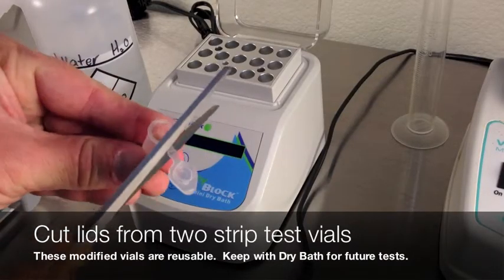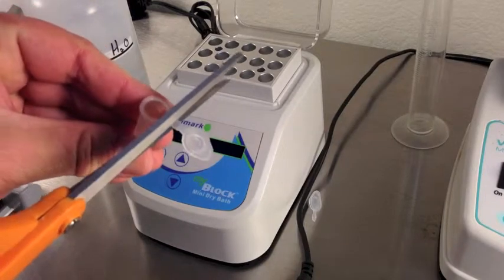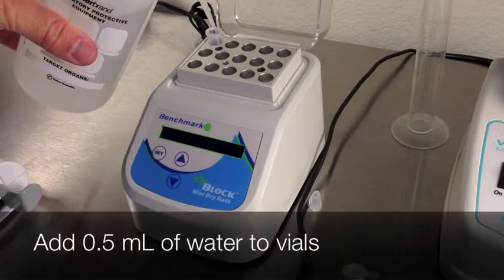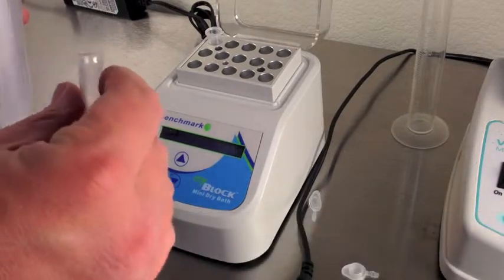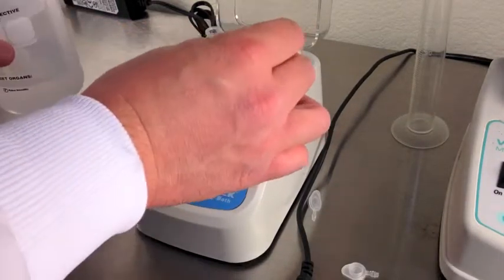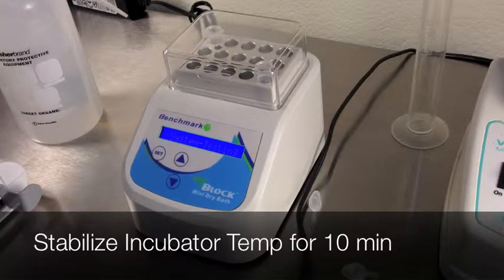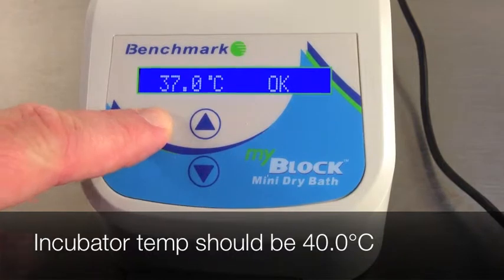To set up the dry bath incubator for the first time, cut the tops off of two strip test vials. These vials will stay with the incubator. At the beginning of every shift, add half a milliliter of water to each vial. Then keep the incubator lid closed for 10 minutes to establish proper temperature and humidity in the incubator.